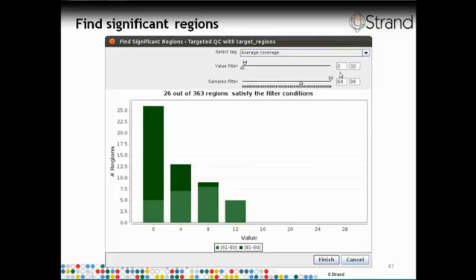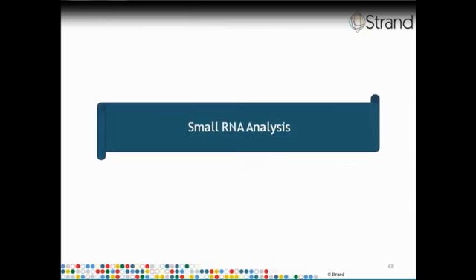It consults a sample sheet file to find the sample name to associate with each one of those sample numbers. It goes through the FASTA-Q files. It drops off the reads which have been flagged as invalid by the Illumina software. It carries out the demultiplexing and the sample naming. And once the samples are loaded into the navigator, one can carry out an alignment against the reference genome. And after the alignment is completed, one can launch the small RNA analysis experiment.